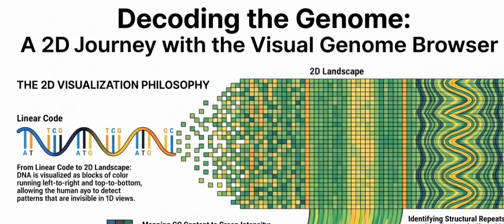But up to this point in our deep dive, we have only been discussing how to navigate a single static entity, the reference human genome. We've been exploring a generic, standardized map. The composite average, yes. But the true power of genetics lies in variation. The entire field of clinical genomics is driven by the need to understand how an individual patient differs from that standard map. What happens when our perfectly navigated location on the reference genome needs to be compared to the messy, mutated reality of a disease state?